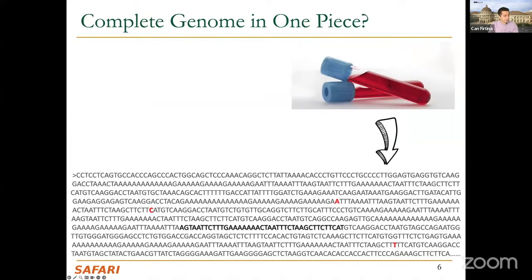To start with, we're going to talk about a few limitations of DNA sequencing technologies. One limitation is one of the big limitations.